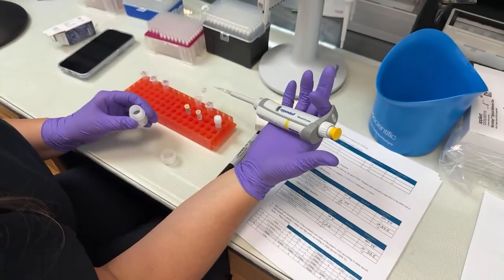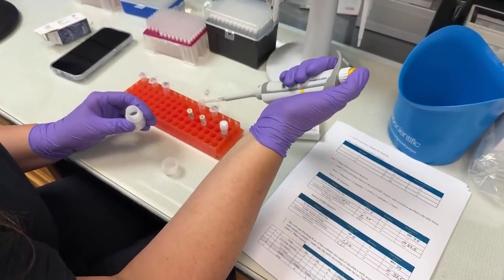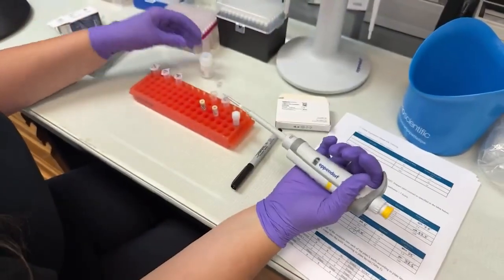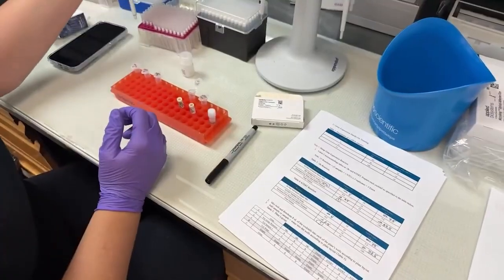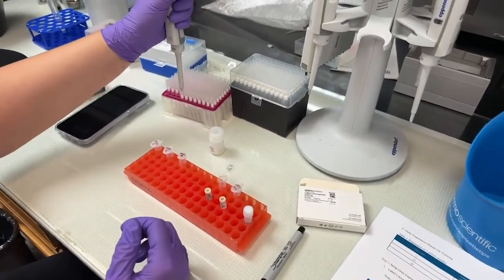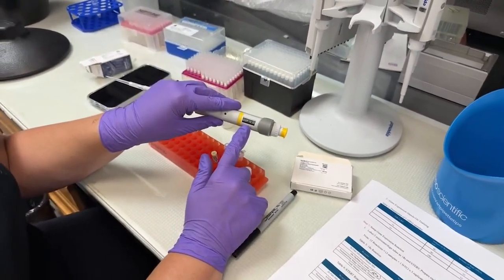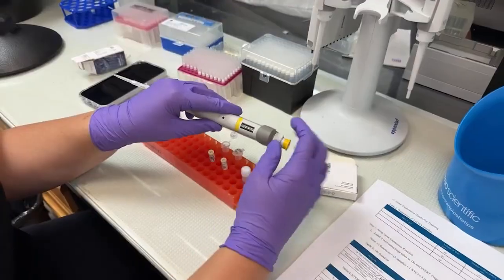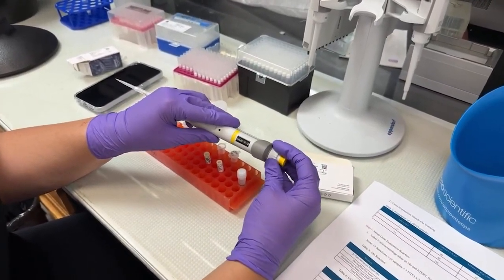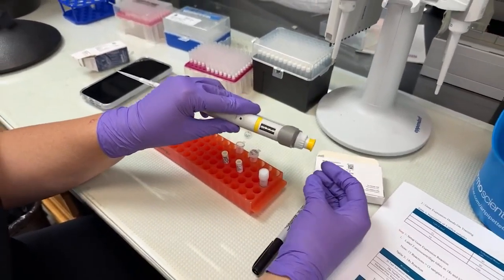So if you've ever used a pipette, just reminders: when you want to pick up sample, you want to make sure that the tip is fully attached. So line it up and then give it a nice solid push. You want to make sure it's dialed up for the appropriate volumes. This one can be changed. There's a bunch of different models, but you can dial in exactly what you want. So make sure that is correct.